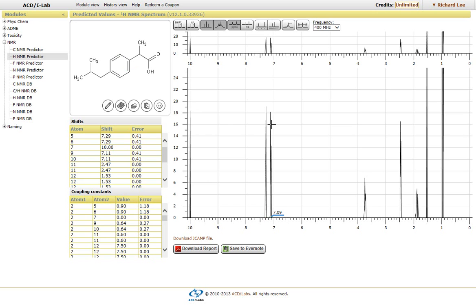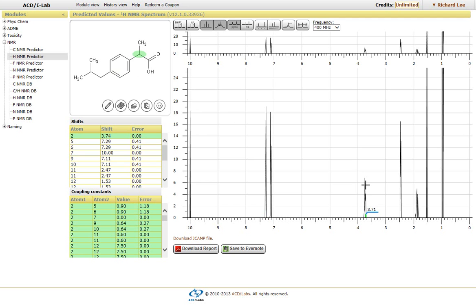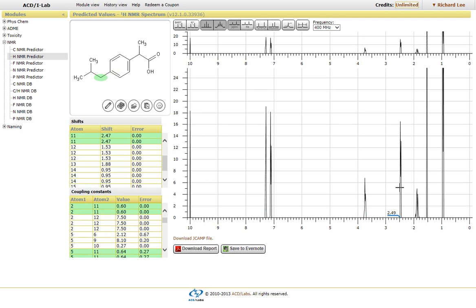So as you move from one peak to another, you'll notice that it highlights another region within the structure.